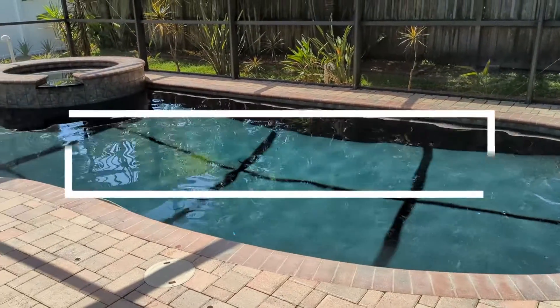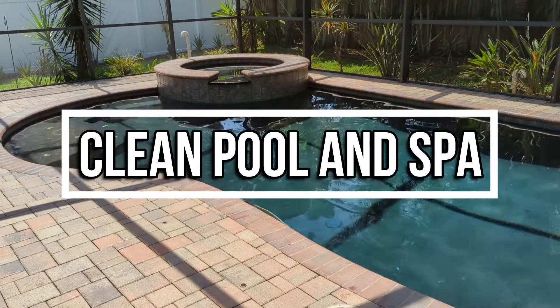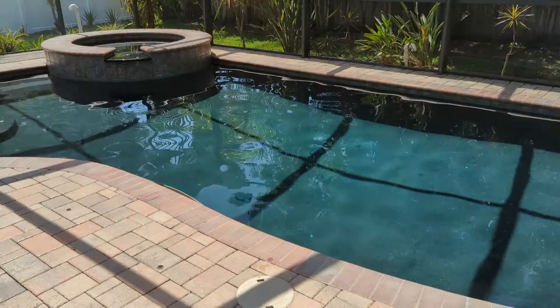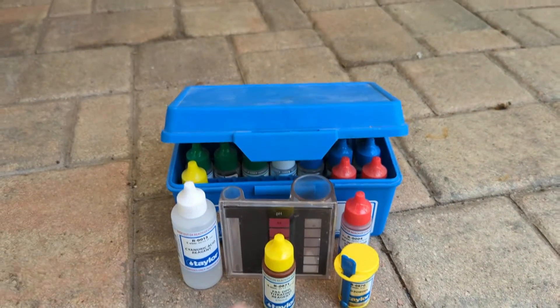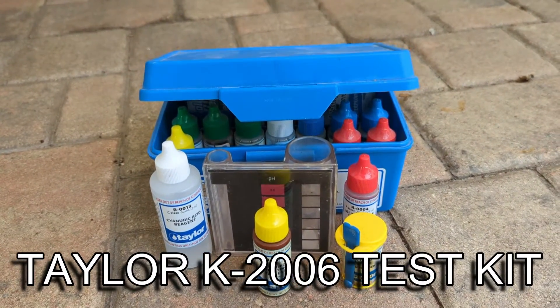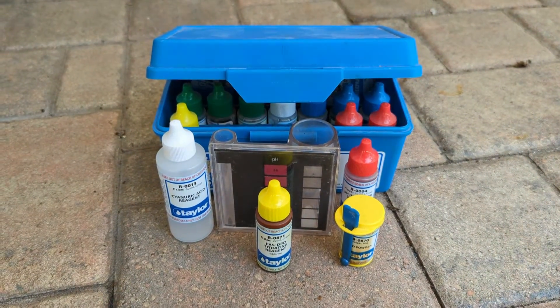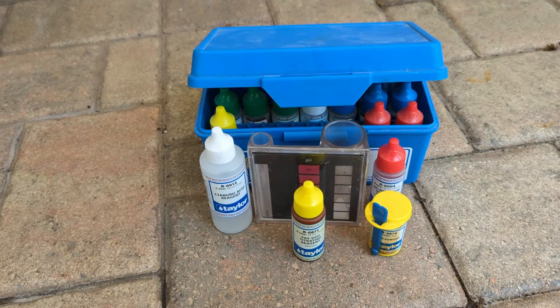Hey guys, it's Robert with Clean Pool and Spa at an undisclosed location. I'm doing a pool inspection right now, and I wanted to ask you: do you think I've just discovered the greatest test strips ever? I have them right here. We have to test them against something, and today I'm going to test them against the Taylor K2006 pool water test kit — the best on the market. I'll compare chlorine, pH, and my favorite, the stabilizer. Let's get going.